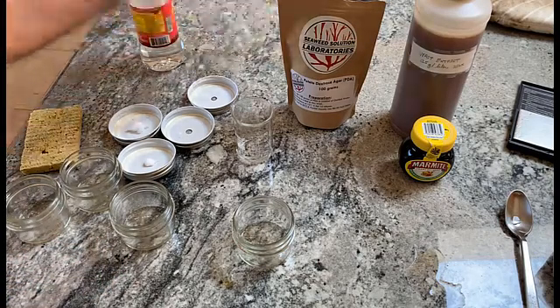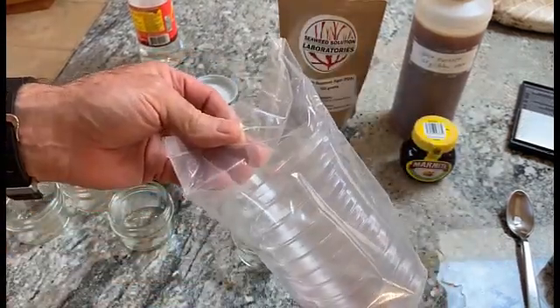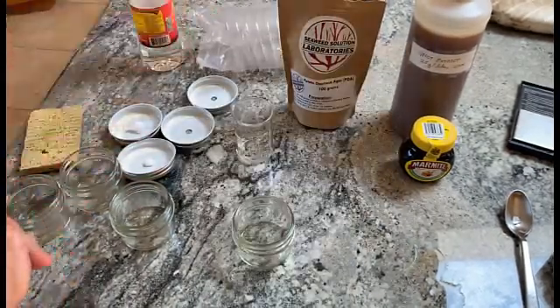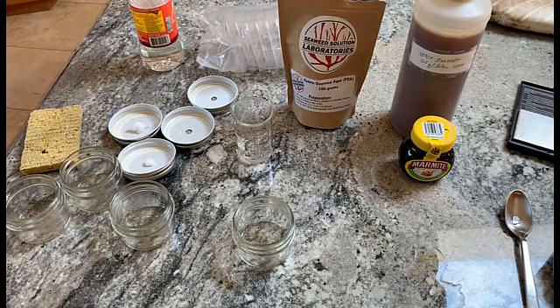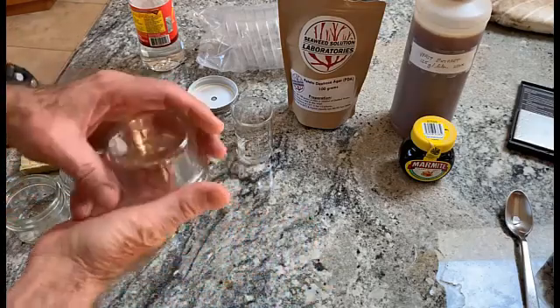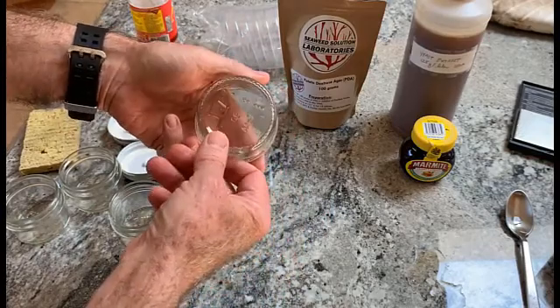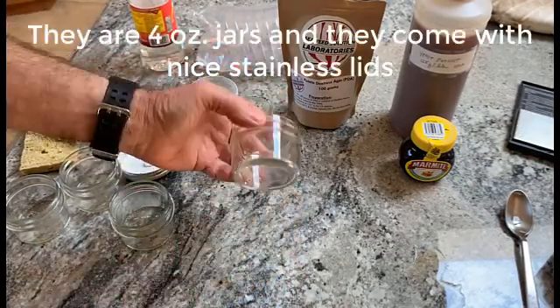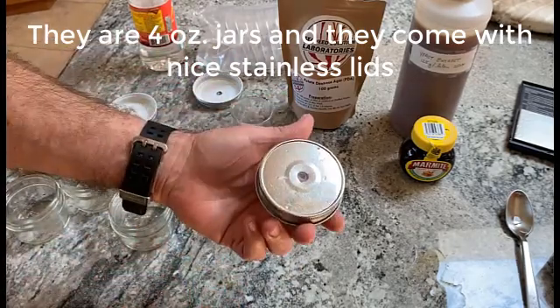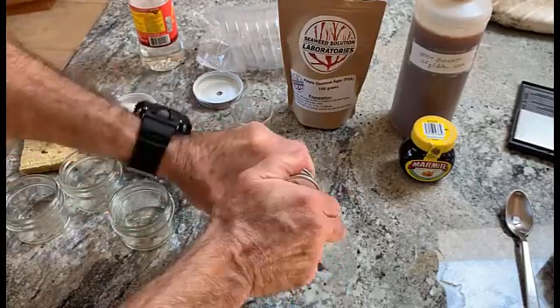I used to make plates using plastic petri dishes like many other people do, and that works. However, I had a lot of contamination from time to time, so a while back I adopted this strategy. These are really inexpensive little jars — I think they're probably two ounce — and these are seamless steel lids you can buy for them; they make a tight fit.